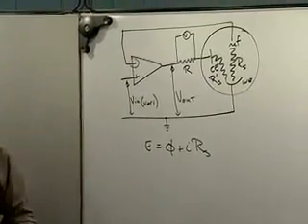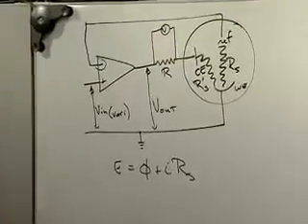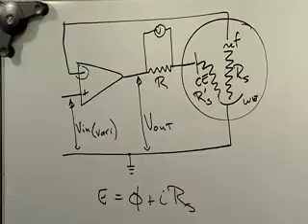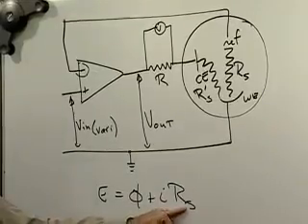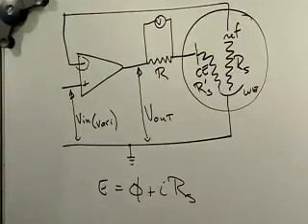But if you're using a solid electrode, if you're using a platinum electrode like I was suggesting, or a semiconductor, they burn really well, it turns out, and if you use IR compensation and you get it right on the money, you throw away your electrode after that. So IR compensation is an interesting issue.